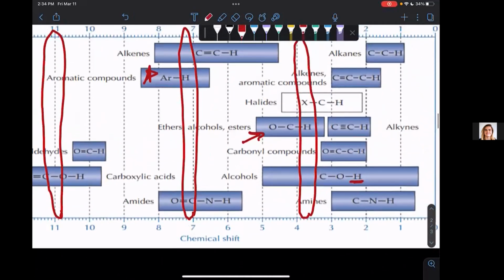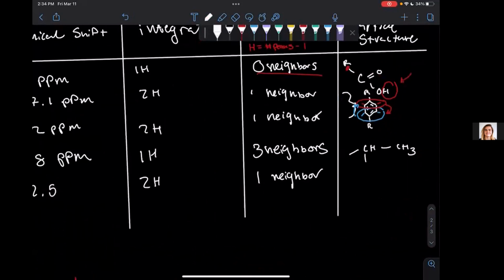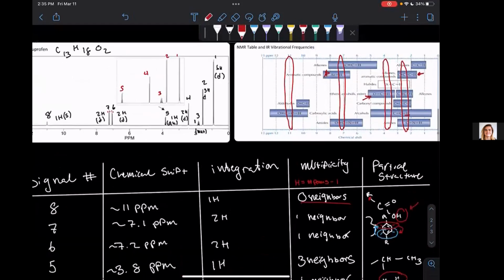So we have a ton of options here. So all of these are going to be solid options. However, I'm going to be leaning towards kind of the alkenes. And yeah, so these alkenes are going to kind of be what we're looking at. We're going to kind of draw just an idea. So we know that we have 2 hydrogens with one neighbor. So we're going to have C, H, H, H. It's next to a carbon here. Maybe it's a double bond to an O. Just kind of an idea. And this would have, excuse me, hydrogen on it. We're looking at these 2. This is just kind of an idea. We're not entirely sure about that one right now.